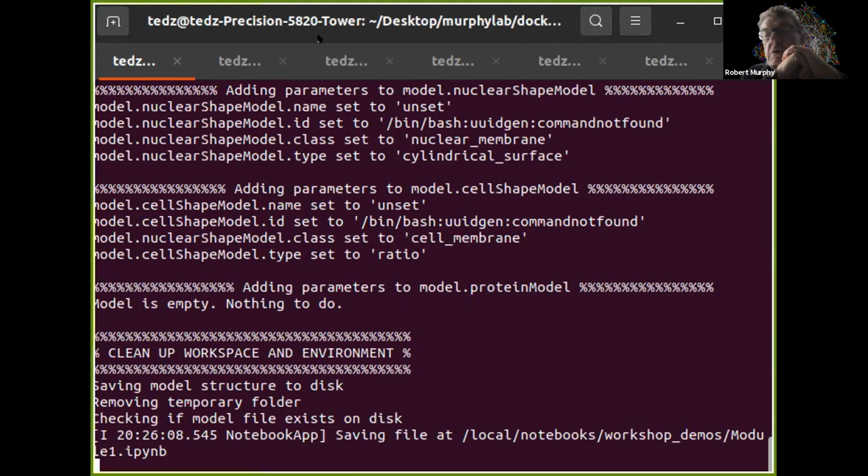Once you do that, if you haven't already, you want to run that notebook that downloads all the files. Where's that notebook? Once you go to the URL, at that page you will see a notebook called download files. I would download, copy, so correct me if I'm wrong, sorry, Robert.